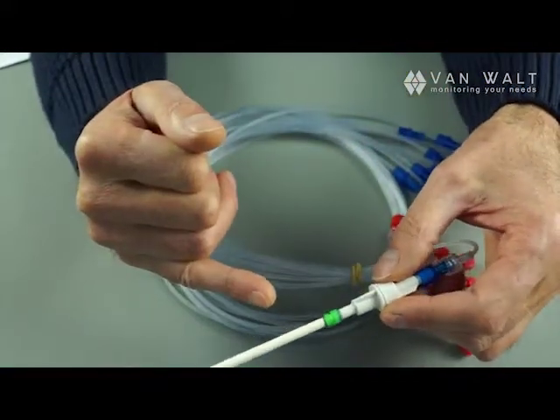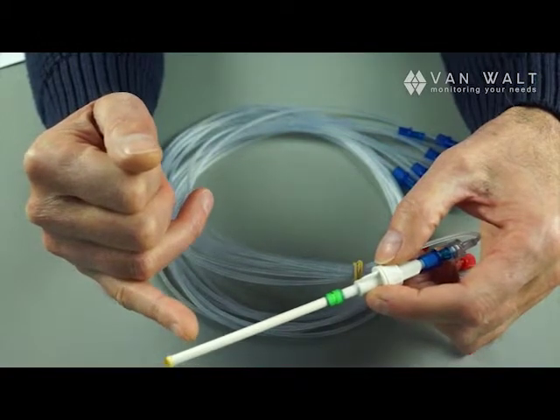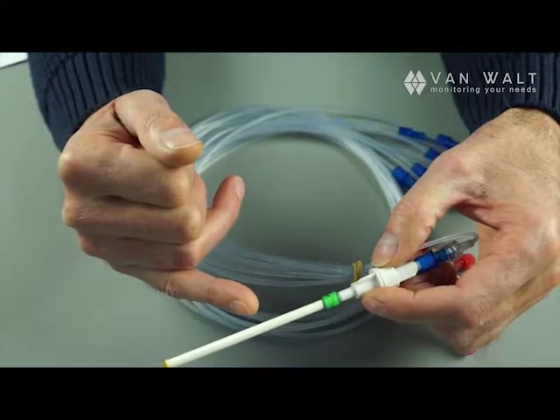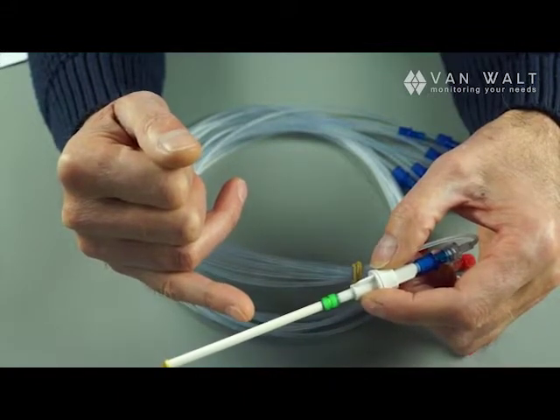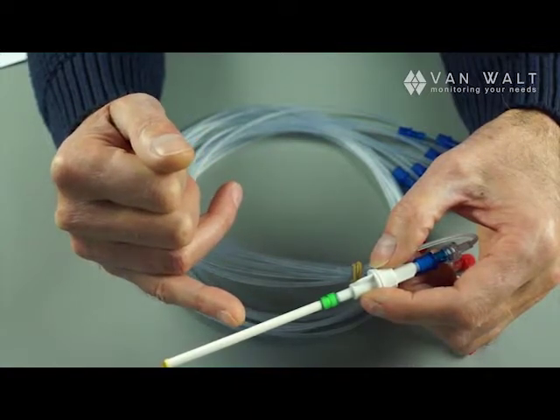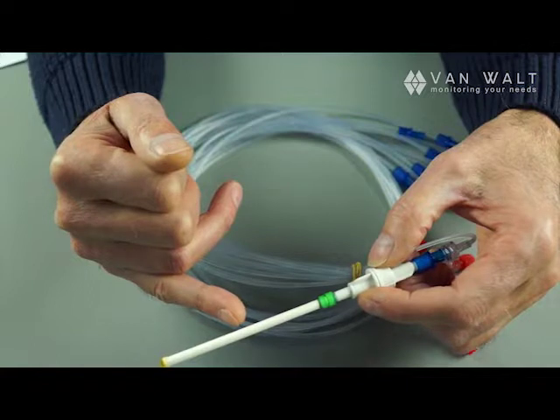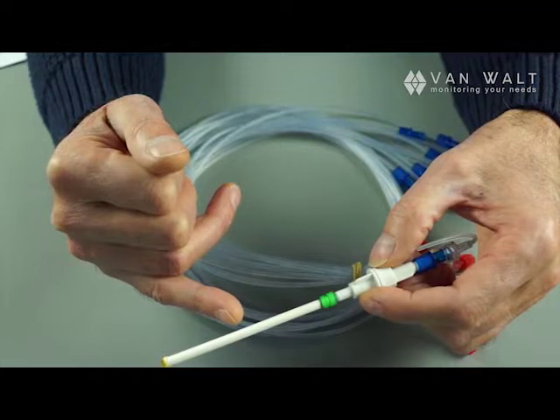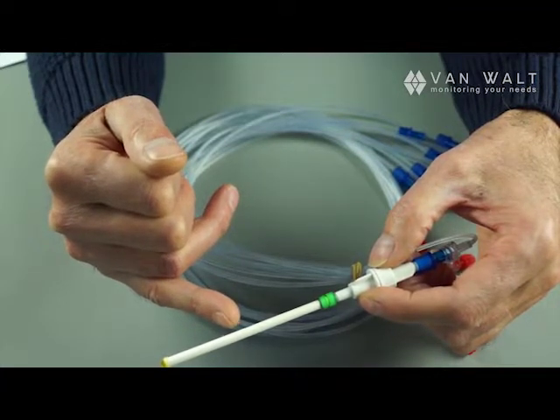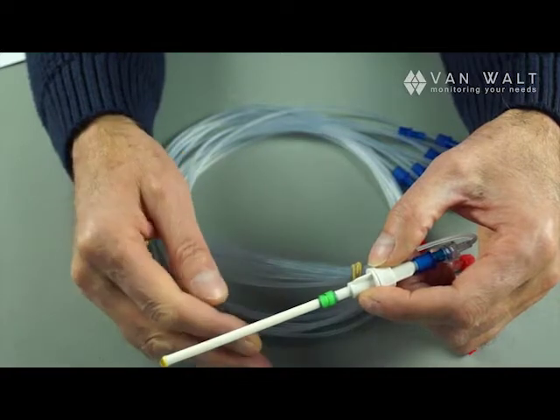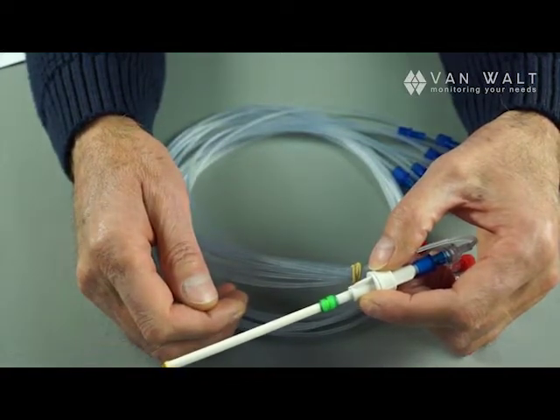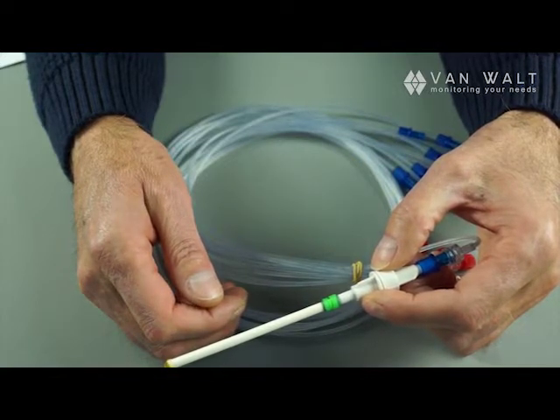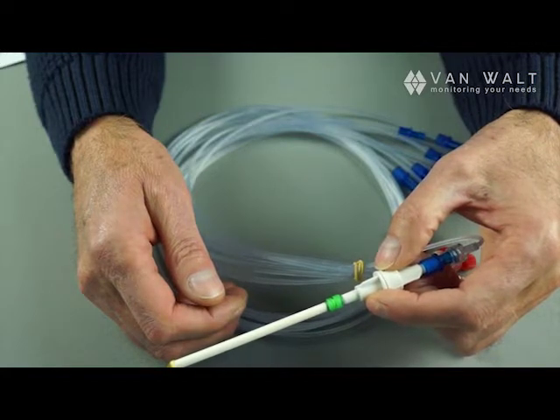Where you have any compounds which have a long string or are rather large molecules, they will not be able to pass through the pore. The pore size is between 0.1 and 0.2 of a micron, so if you have pesticides, PAHs, they will not be able to pass through the pore size. So it's something to be aware of. Know what it is that you wish to measure and just double check that the compound or the element that you're trying to measure is small enough to pass through the pore size.